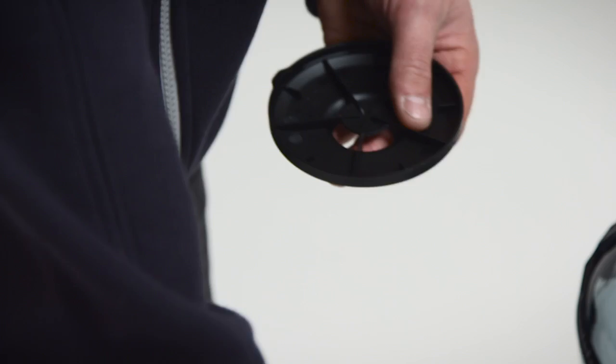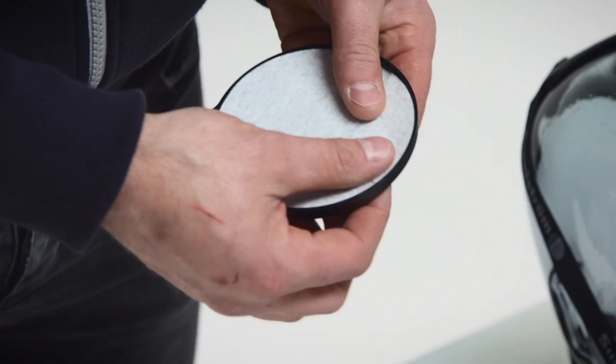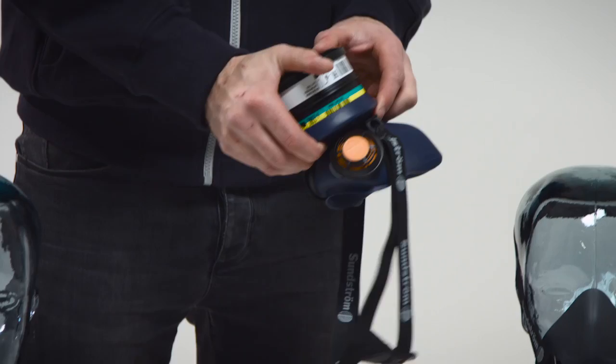Fit pre-filter SR221 in the pre-filter holder and press it into place on the filter. See also the user instructions for the relevant filter.